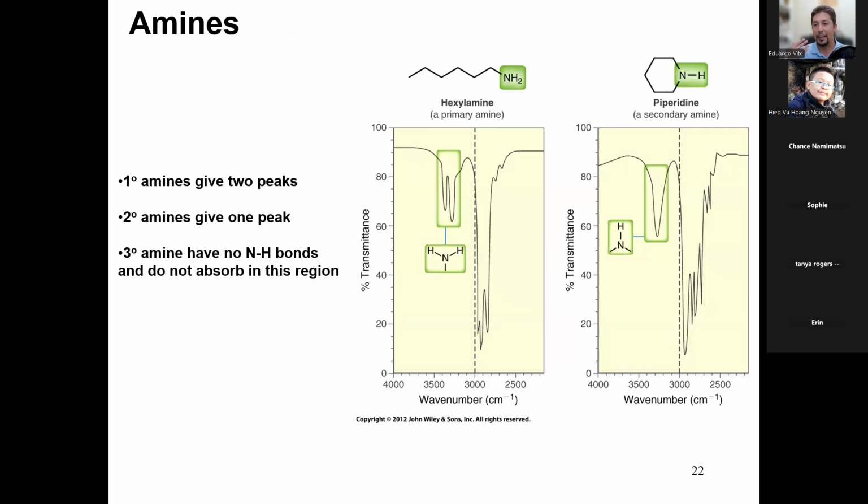And so you see that primary amines, they have two NHs and one NC. That means you have two signals. Primary amines give you the two signals here on the left. Secondary amines give you one signal that you see here on the right. And notice that the stalagmites of the CH stretches are here. They are always at a lower wave number than these peaks.